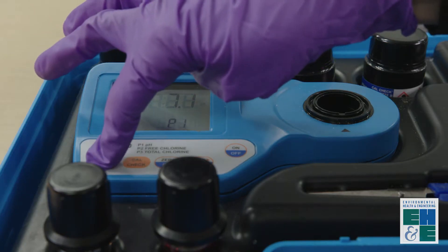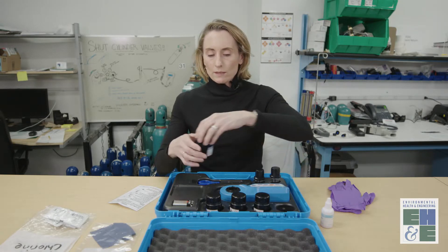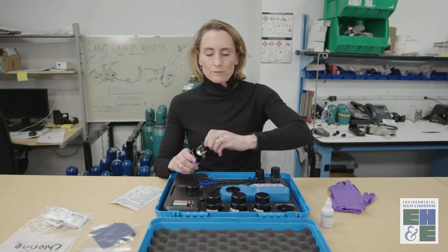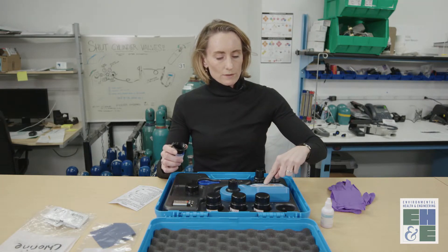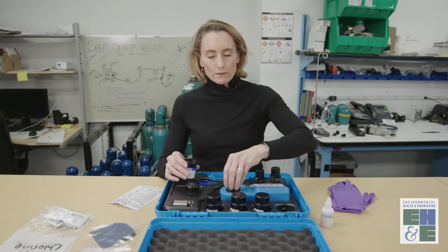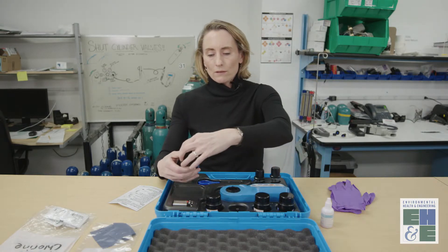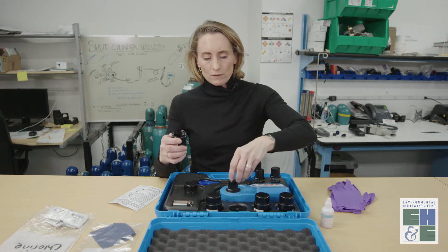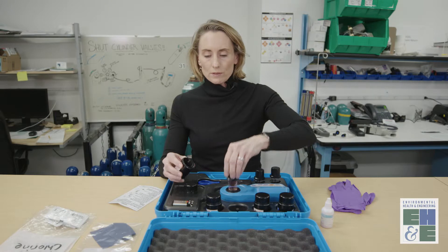Now we'll press range to change to P2, which means we're going to calibrate the free chlorine measurement. We'll need the zero again — you press CalCheck, insert the zero again, and press zero. That's reading 0.0. And then we take the free chlorine calibration standard — you can see that it's spiked. Line up the arrows and hit CalCheck. That's reading 1.00, which is accurate.